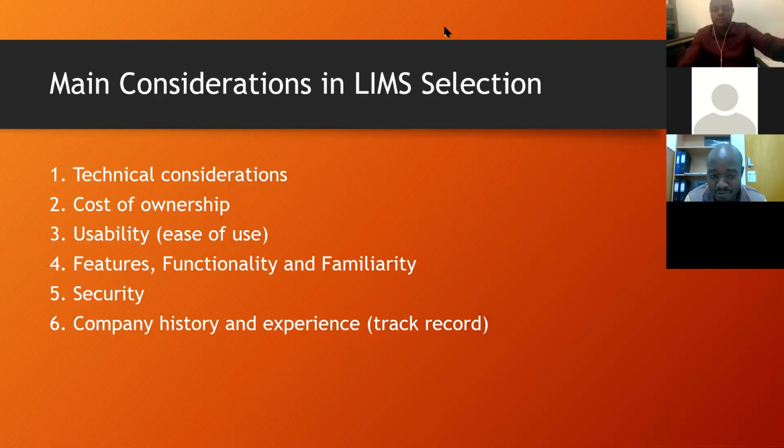So that should also inform you when you consider an application. Then you also look at security. Security is critical because we are dealing with patient information. You need to understand whether the data is safe, whether patient information is safe, and this is done within the confines of the in-country regulatory framework so that there is compliance.